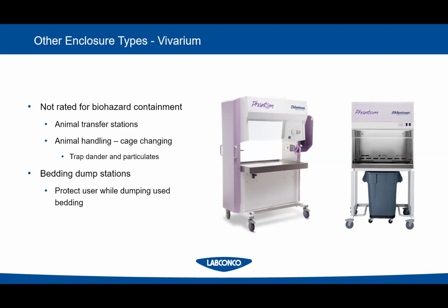Cage changing stations and bedding dump stations are HEPA filtered. They'll get a lot of the particulate, protecting the workers in the vivariums from any exposure to dander, animal hair, all of those types of things. And they do have HEPA filtered downflow air and HEPA filtered exhaust. They're often open on all sides, so they're not going to contain as well as, say, a biosafety cabinet. So while they're great for general cage changing operations, assuming those animals can be changed in that type of cage, they are not considered class 2 biosafety units.